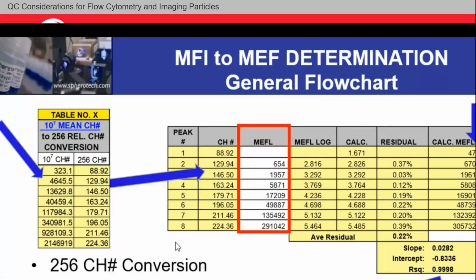You're extrapolating, and maybe you only want to know the confidence with which there is a difference. You can't always say there's absolutely this many on versus that many. Now, we could talk in those terms. We're talking more about compensation. We're talking more about, do you have the exact same fluorophore on the surface of probably the exact same material, right? Otherwise, they will have slightly different fluorescence intensities under the same excitation. A polystyrene particle is not the same as a cell.